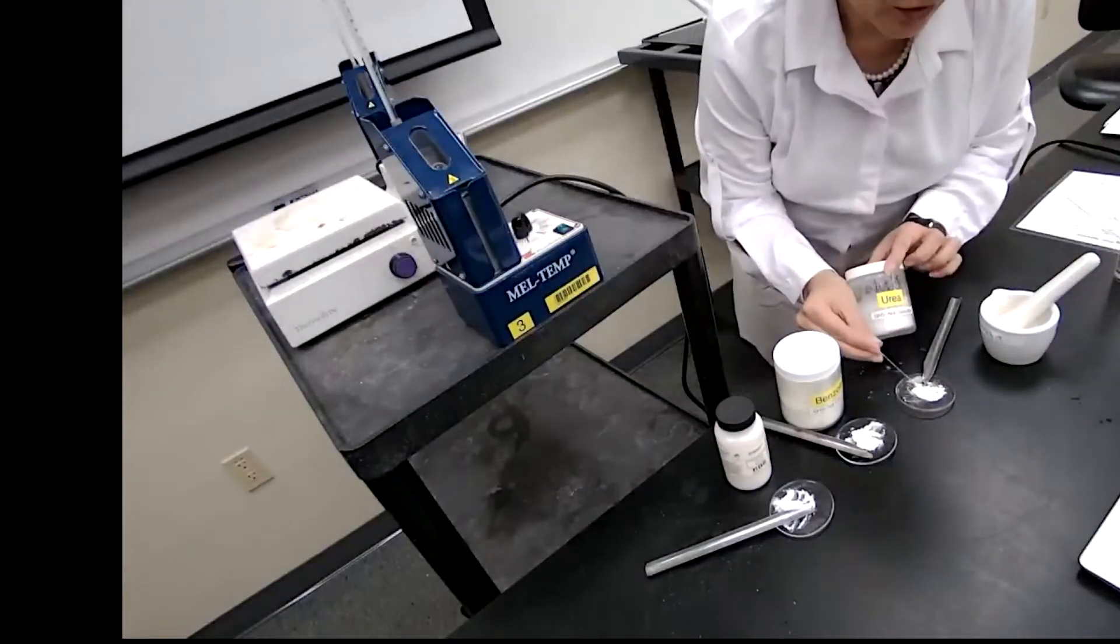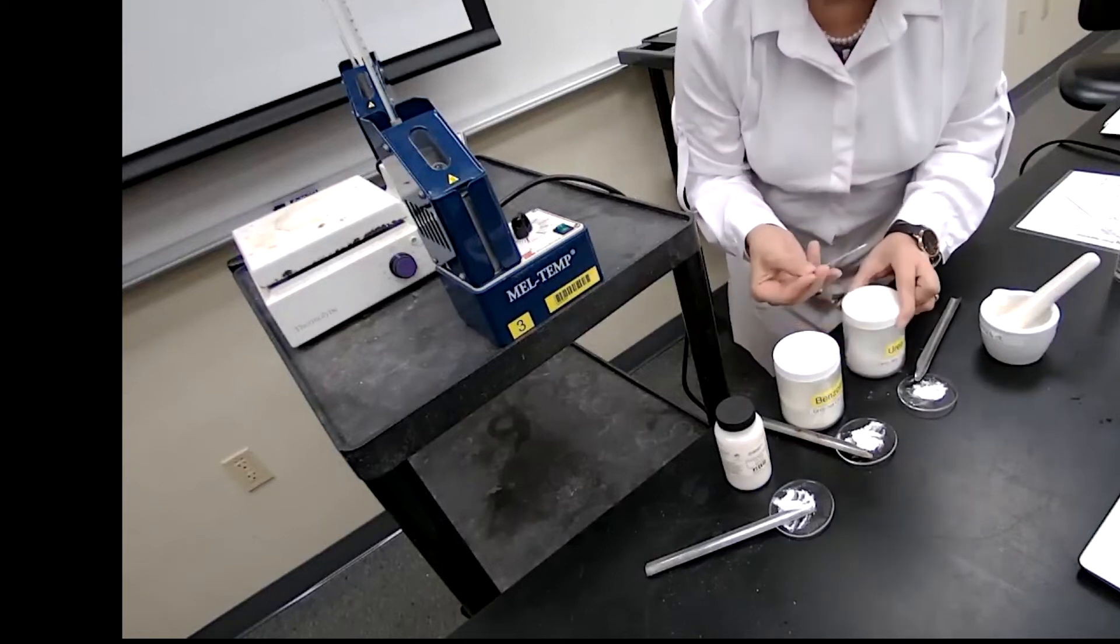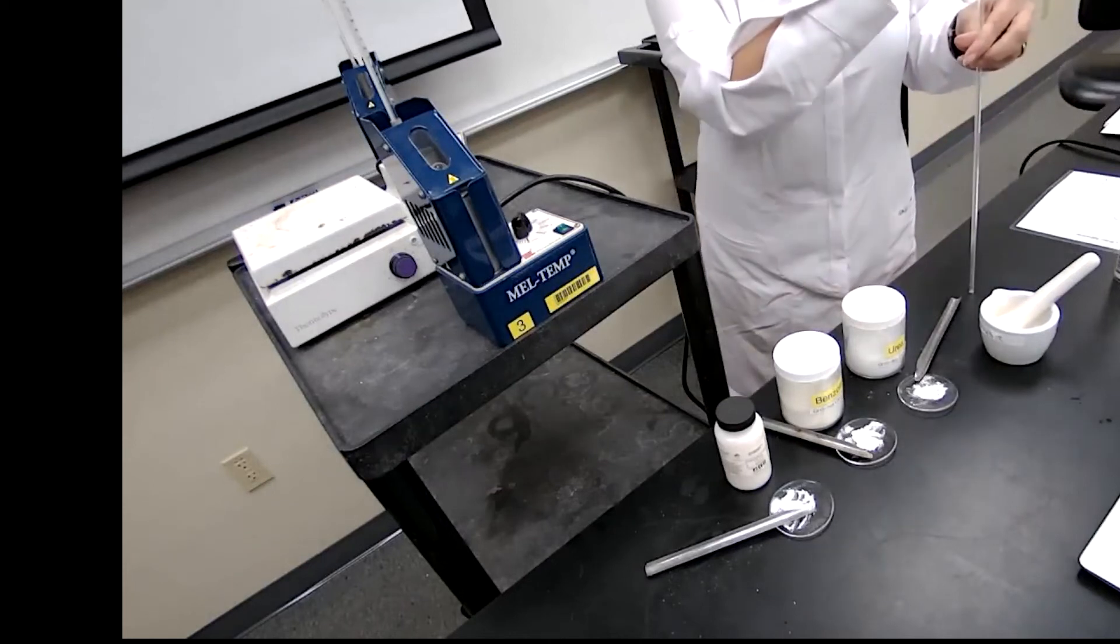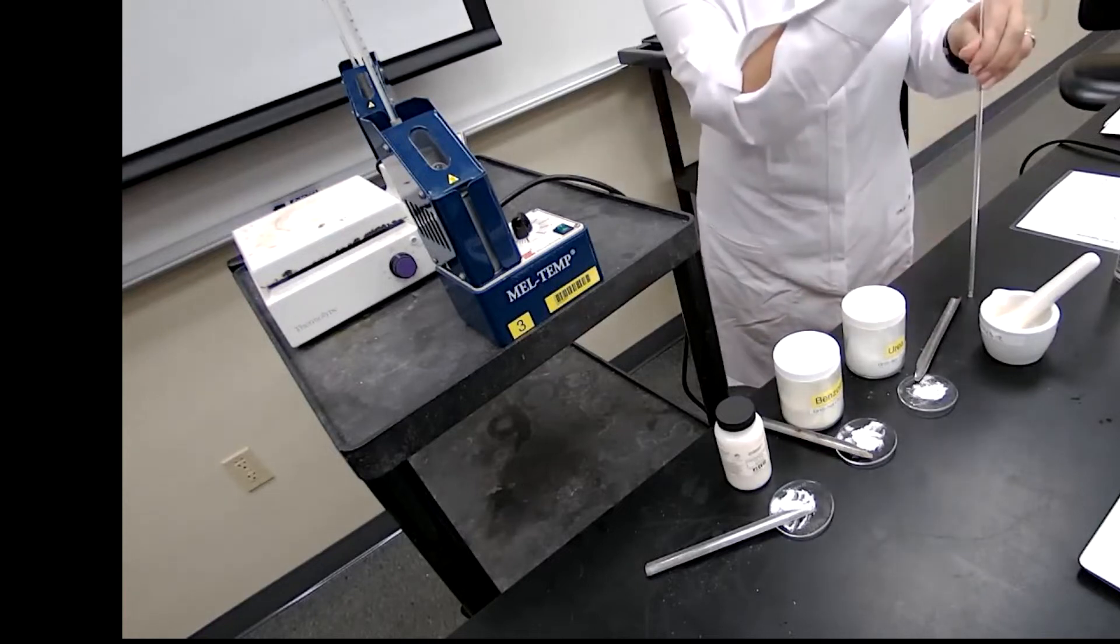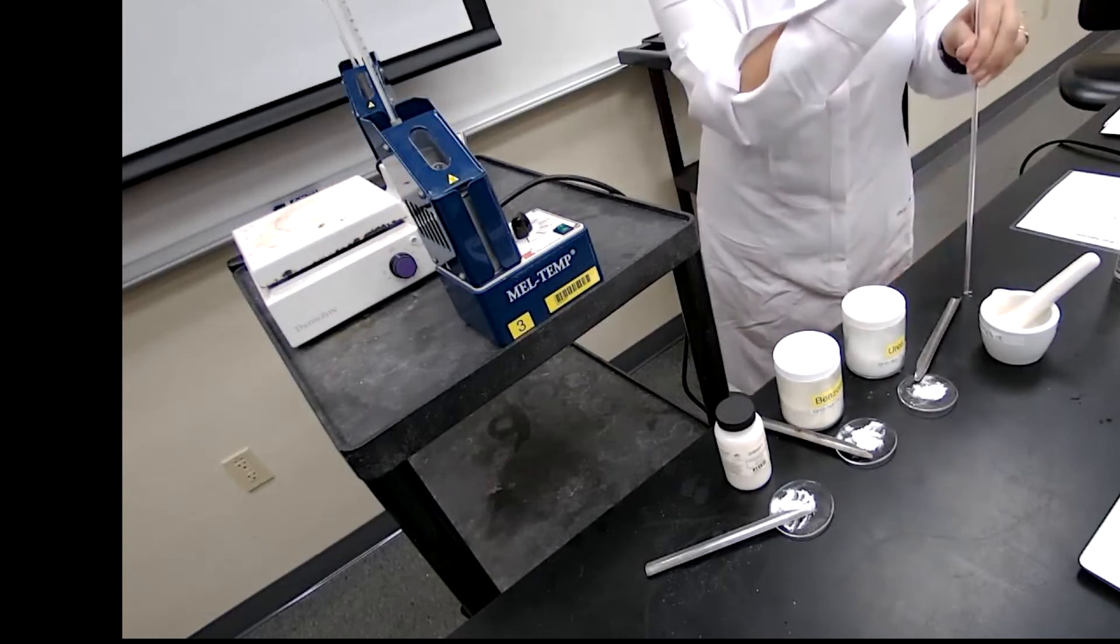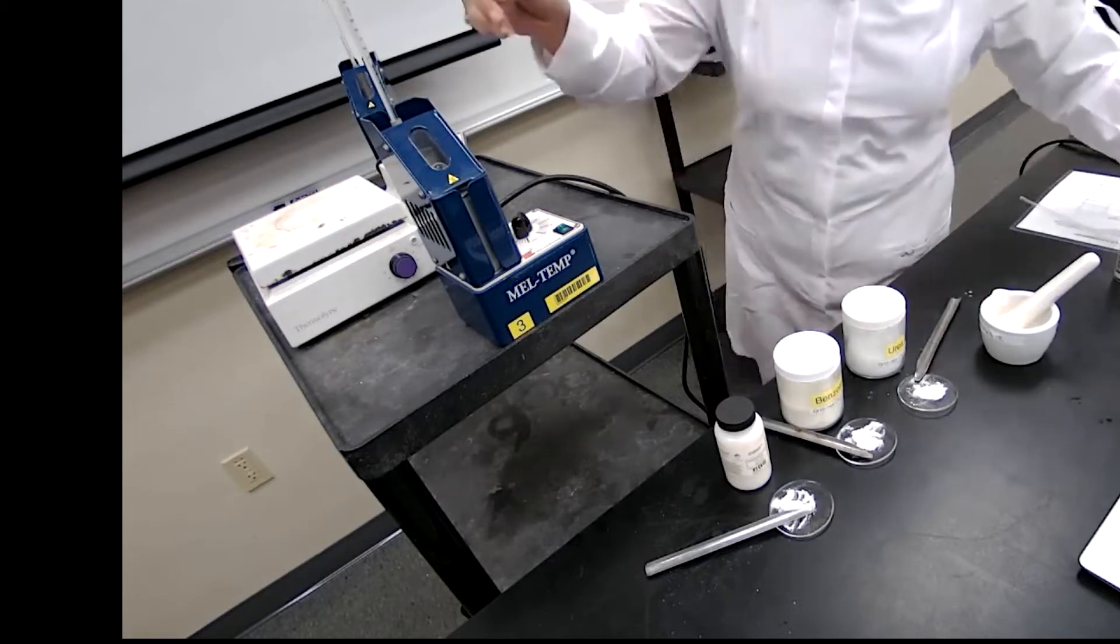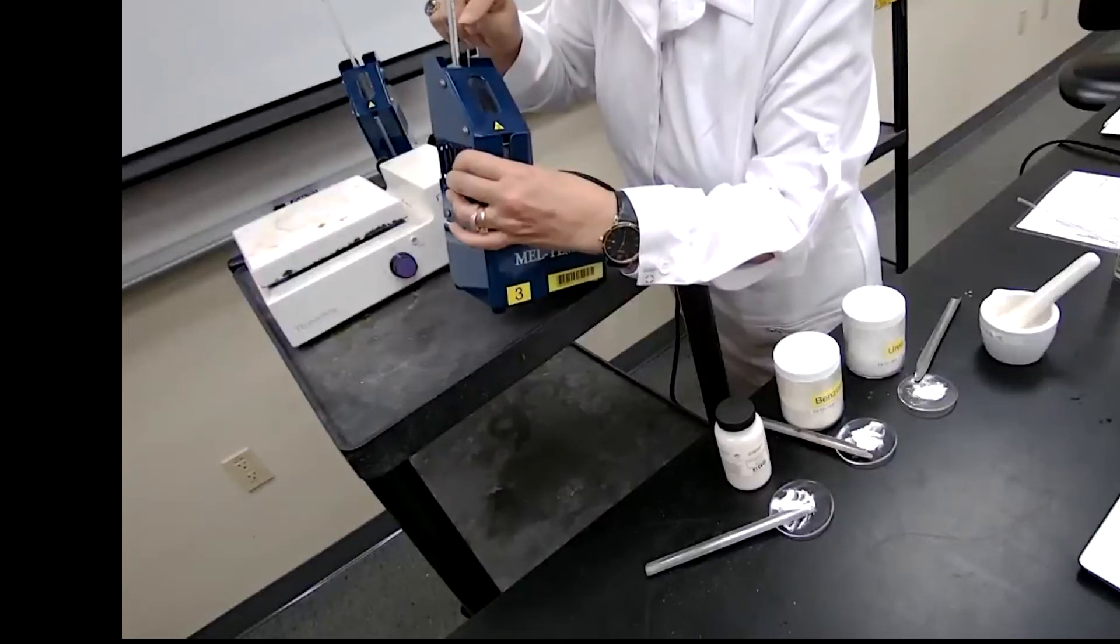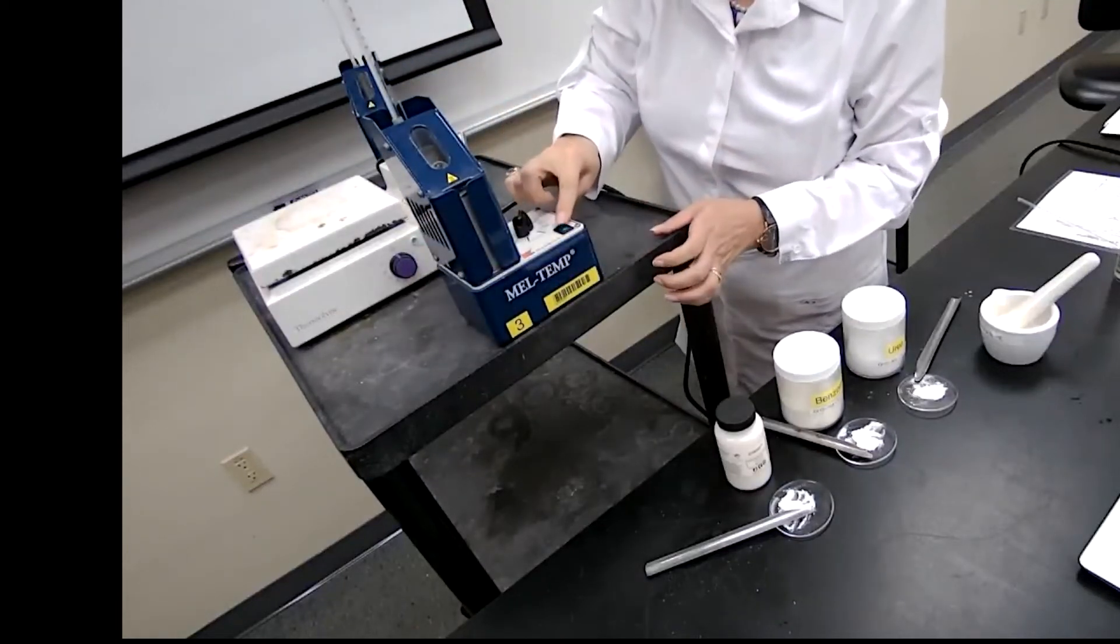The first sample that I'm trying is the mixture of the unknown two with urea. I will make the sample same way as other melting process that we did follow. I would place that in the sample holder and turn on the machine.